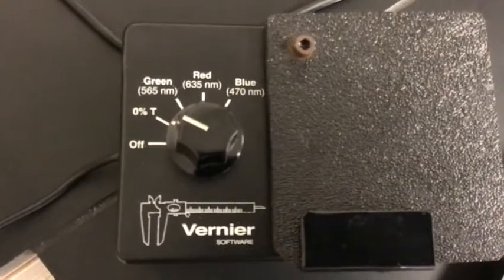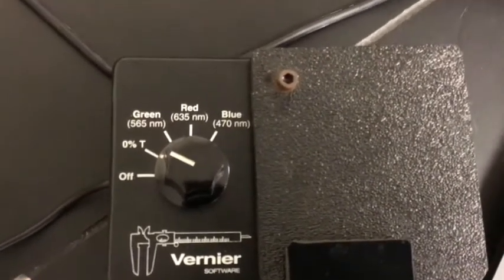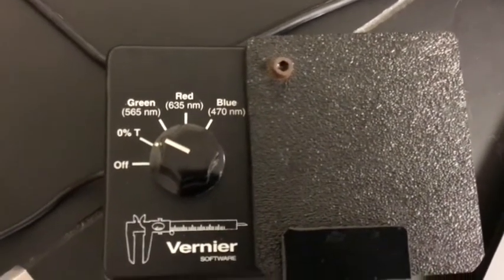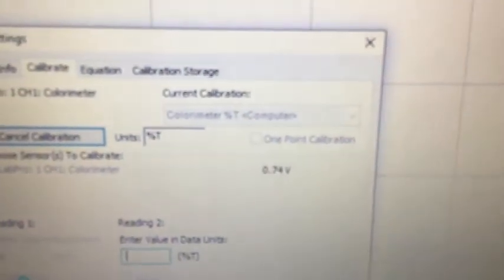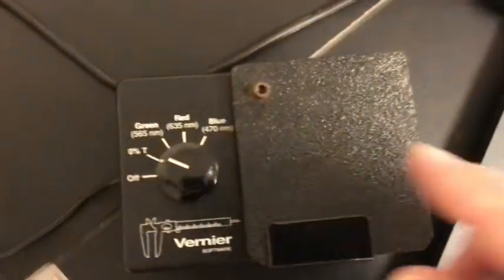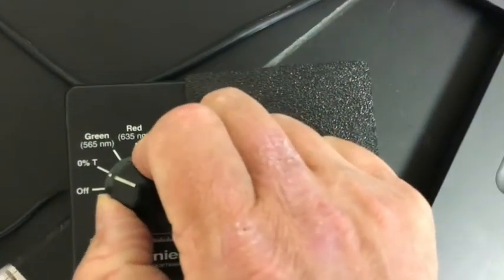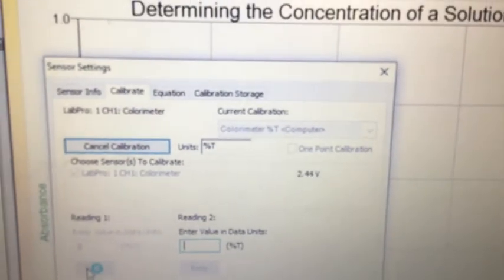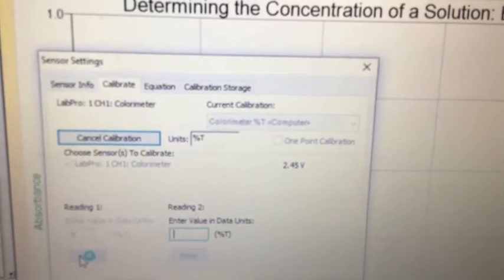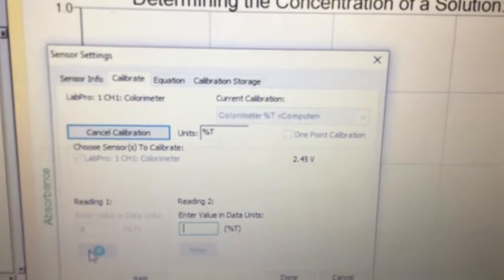Through your experiment you should have chosen either green, red, or blue light — that is specific to your particular experiment. Now turn the knob to your chosen color. Notice that the voltage was around 0.73–0.74 before turning; watch what happens when I turn it to red — the voltage skyrockets way up. If you turn that knob and don't see any change in the voltage, you've got a broken colorimeter and you need to replace it.